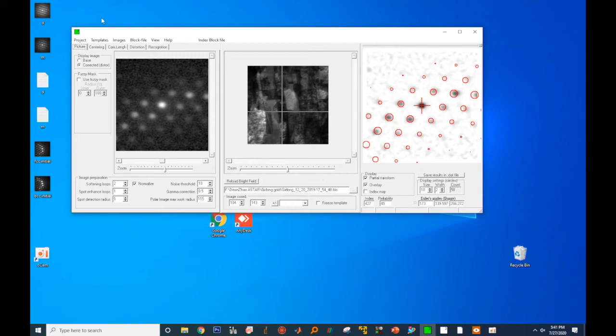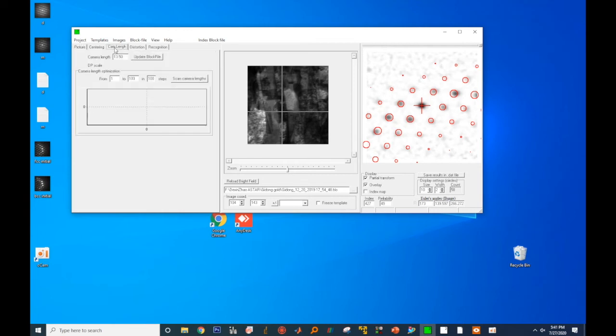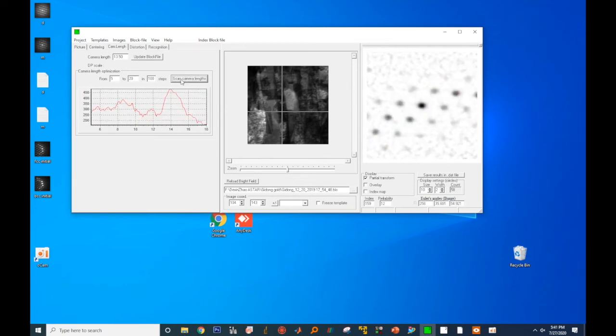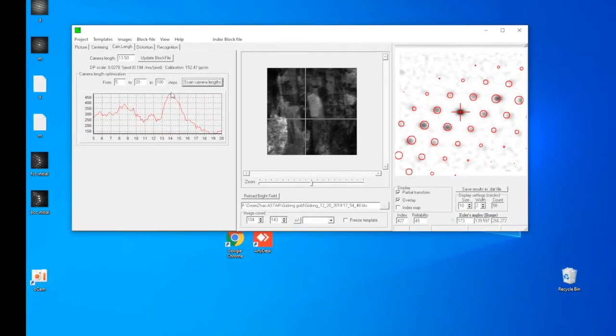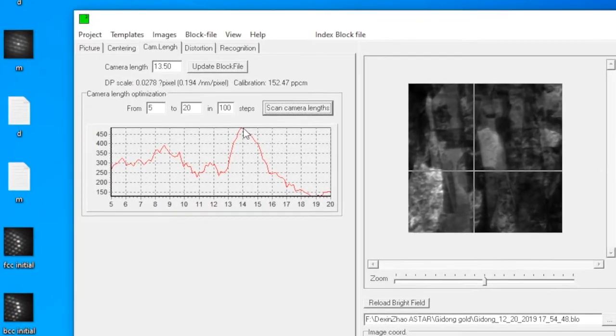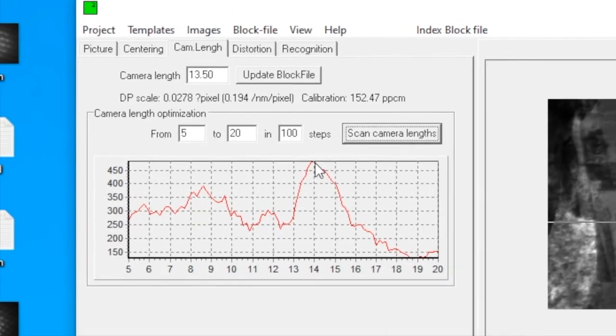To fine-tune camera length, click on camera length. The first window now has changed. For our instrument, we usually do a scan from 5 to 20. Then click on scan camera length to see the highest value or the best match is around 14.